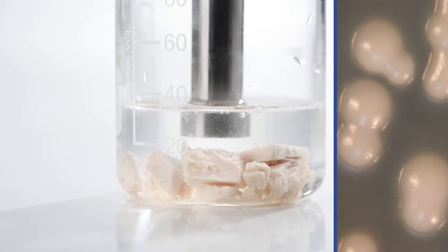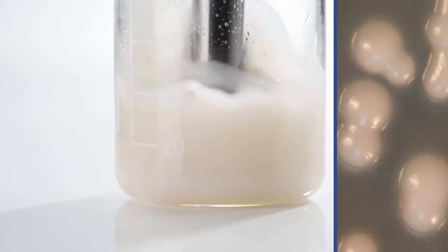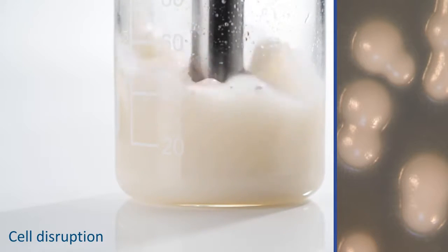Sonopulse homogenizers also boast amplitude control. This ensures that the same volume of energy is always filled in, regardless of the medium's viscosity.